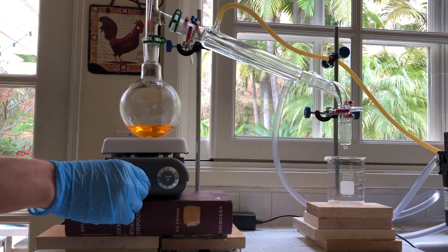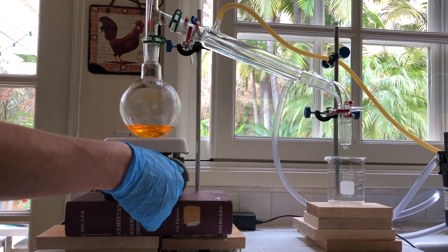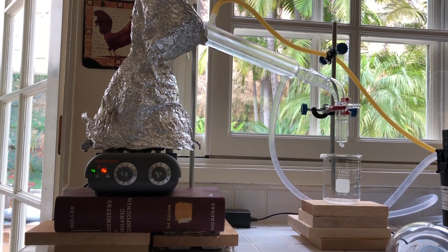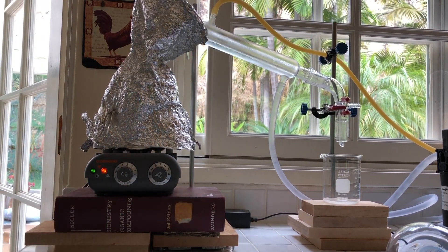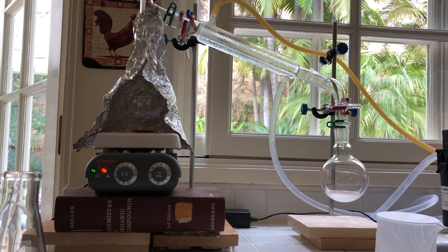Then I set up for simple distillation. I started collecting distillate at about 76 degrees, which was put in a beaker. Then the temperature reached 78 and stayed there for a while. At first I thought this was still forerun, so I kept collecting it in the beaker. Then I remembered that my solution was still wet and this could possibly be an azeotrope with water coming over, so I swapped the flask and collected distillate until the rate slowed down considerably.